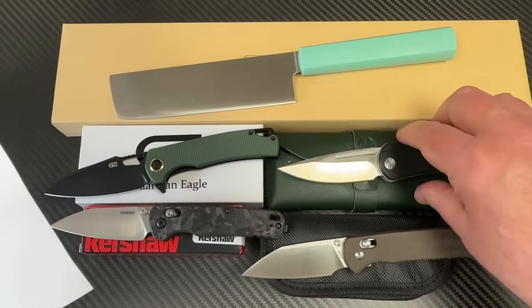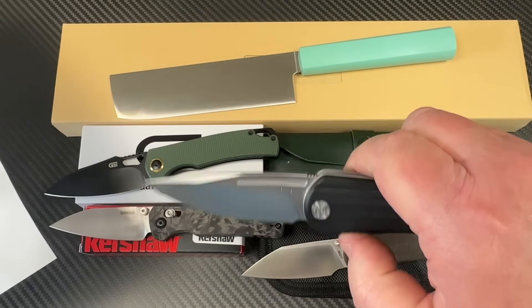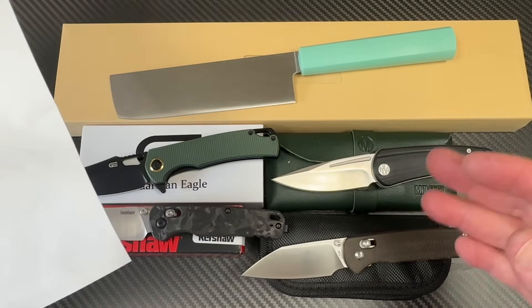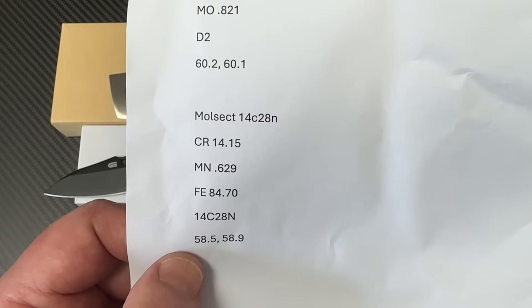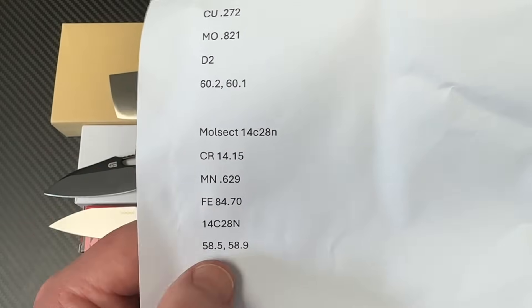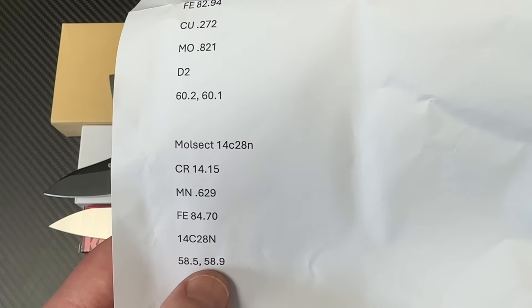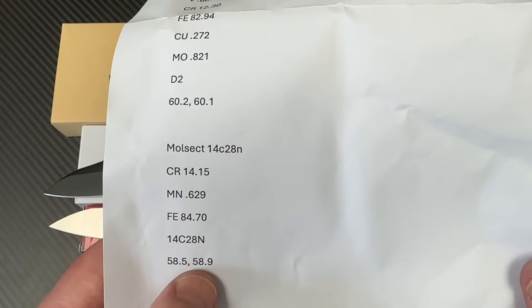Now the Molseck — everybody wants to call it Mole-select. This is tricky. Molseck is 14C28N, and this is the Orbit model. It's nice, it's got a nice drop, it's a front flipper. I had the Jungle too, and I've recently got another one — prototypes though, don't know if they'll actually get made. Here's the elementals. It's a 59 — let's call it 58.9 HRC. It is 14C28N — confirmed. The hardness is adequate, and the composition adds up.